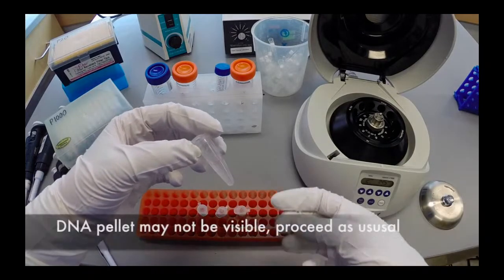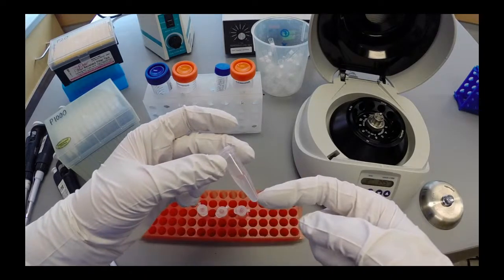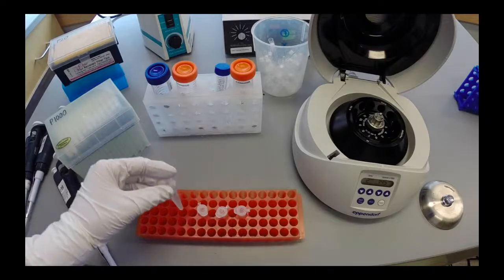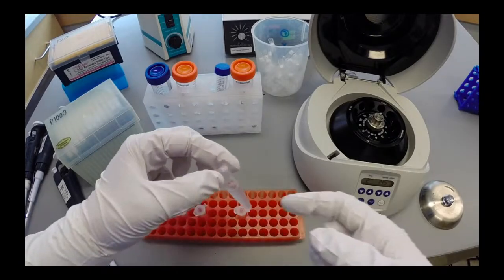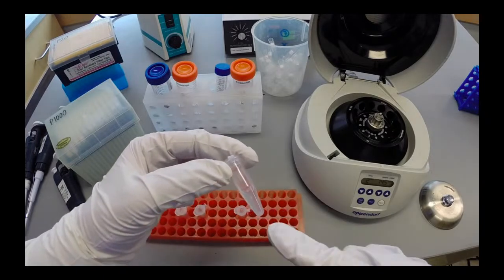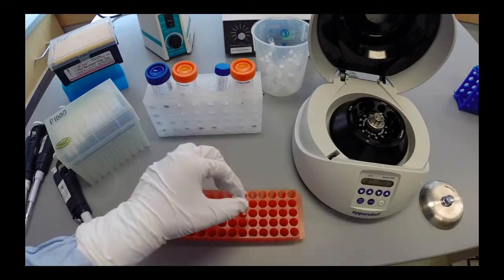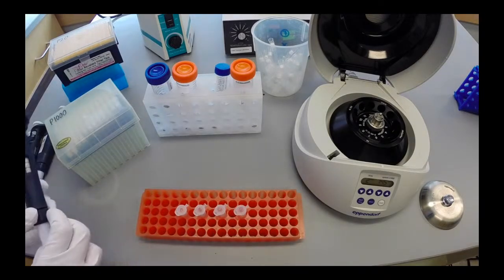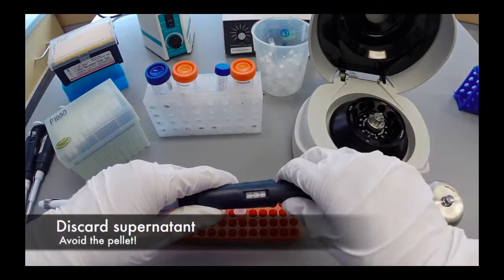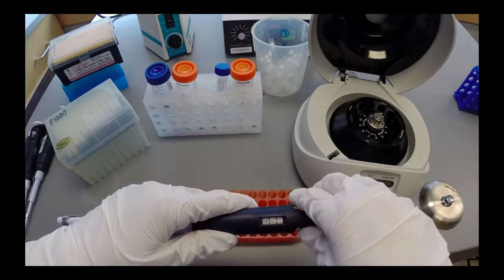Visually inspect for a pellet at the bottom of the tube on the side of the hinge. A pellet is not always visible, so you can choose to centrifuge again or proceed as normal. In this example, a pellet is only seen in samples C and D, but all samples are carried through the process. Using a P1000, slowly remove and discard approximately 800 microliters of supernatant.